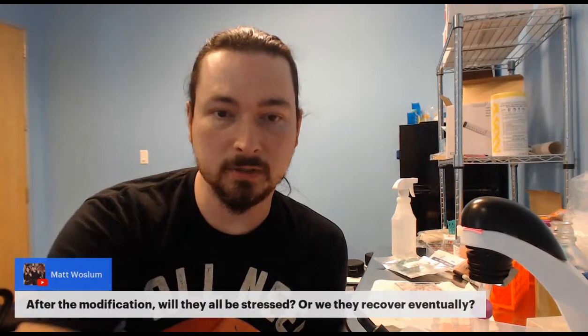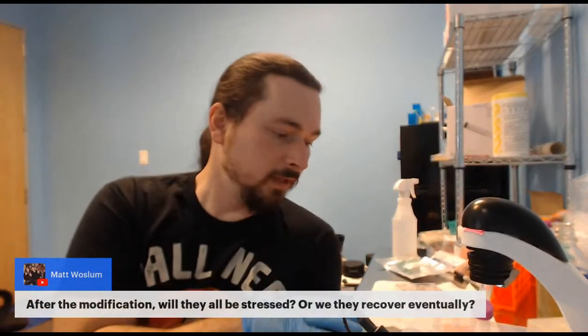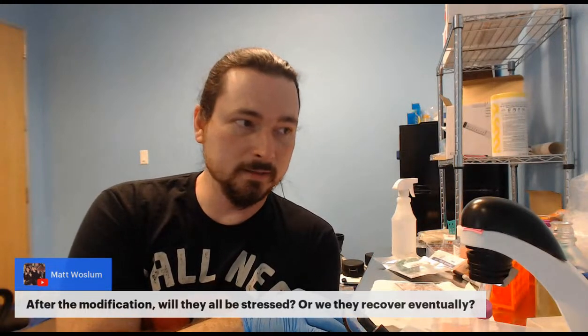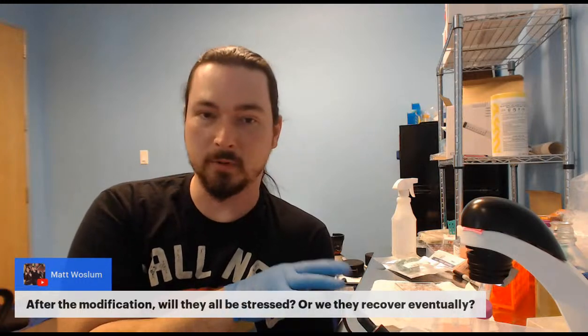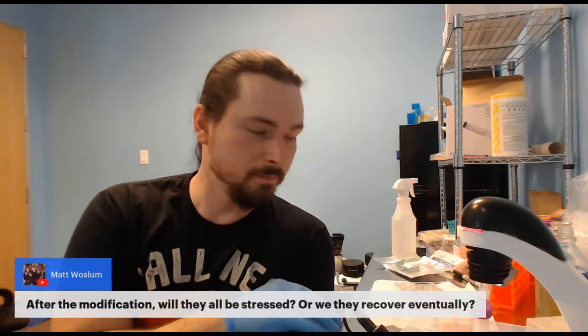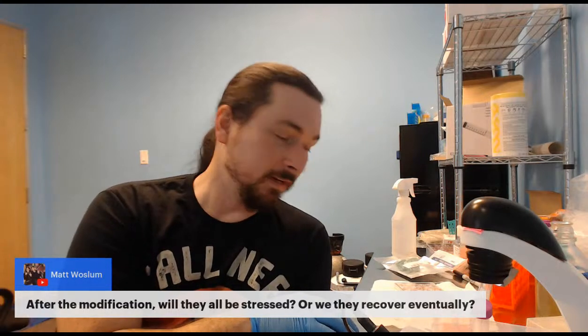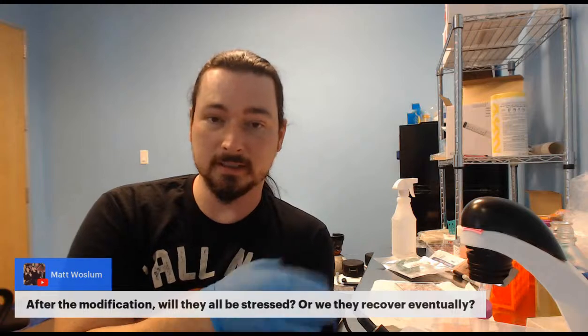After modification, will they be stressed or will they recover eventually? They seem to recover. The XGAL just added doesn't seem to be toxic, but the breakdown products seem to be a little bit toxic to them. They don't seem to like being this blue. But if you don't add that, they'll just retain their modification. You can actually continue to select them.